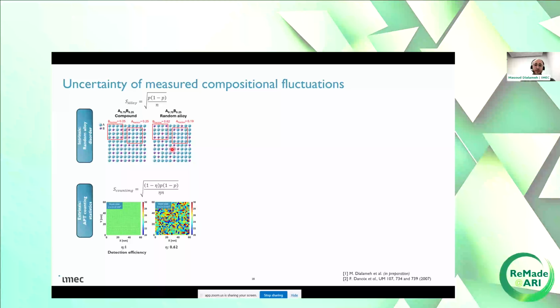While in the case of an alloy, in this case a random alloy, homogeneously, let's say randomly distributed, we can have different composition at different regions of the specimen. So this random disorder of the alloy is something known, but operating at this resolution, we need to take it into account. The second aspect is extrinsic to the material.